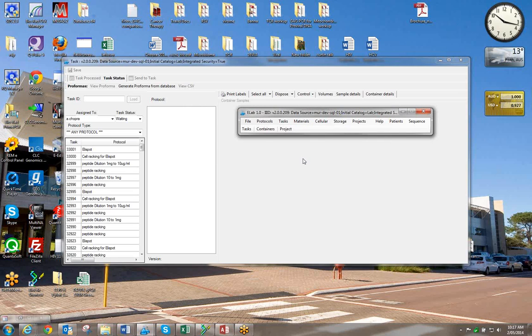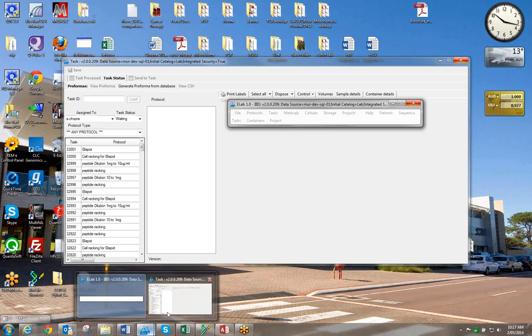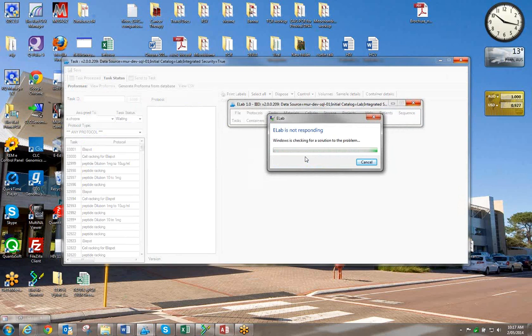When the primer editor opens, this should come up. Why is it taking this long to come up? It's possible this is happening because I'm on the dev server. It shouldn't happen. I'm going to close this, go back and see what's happening.